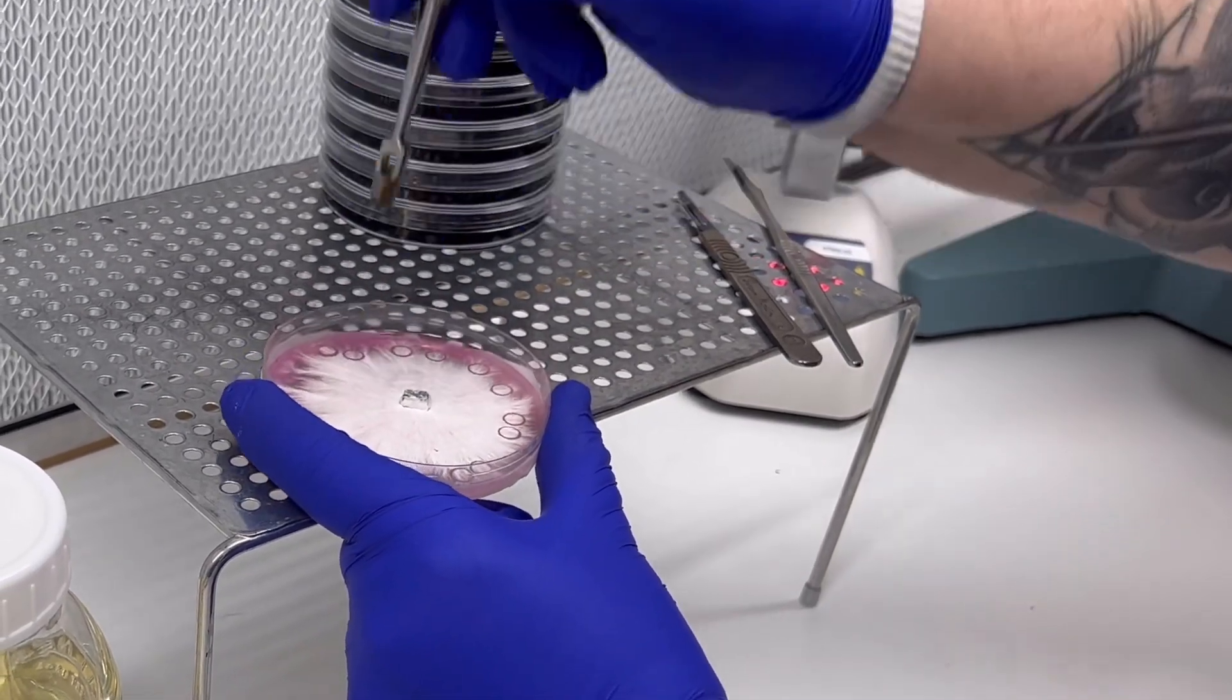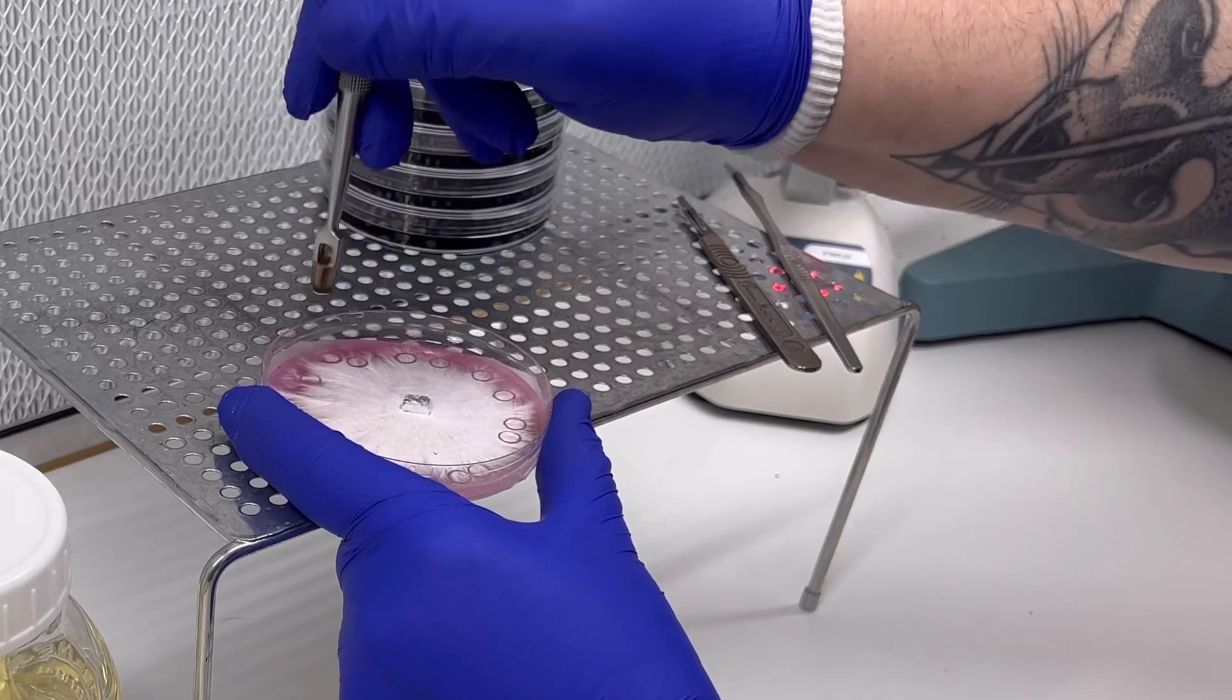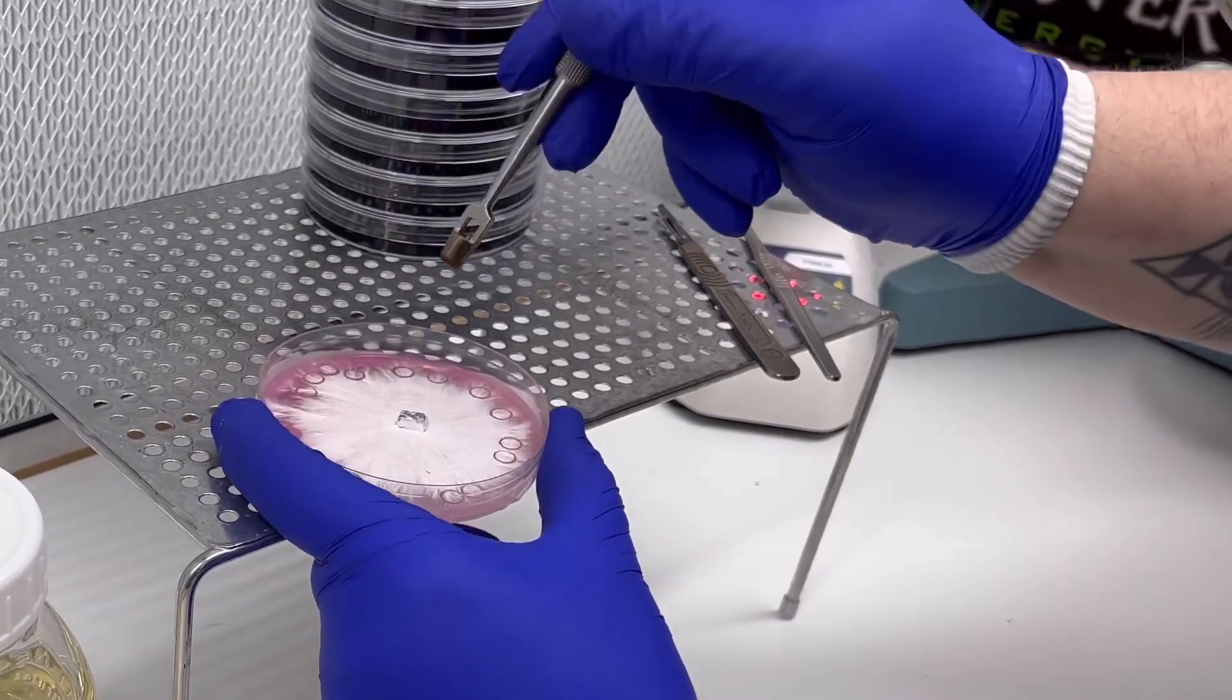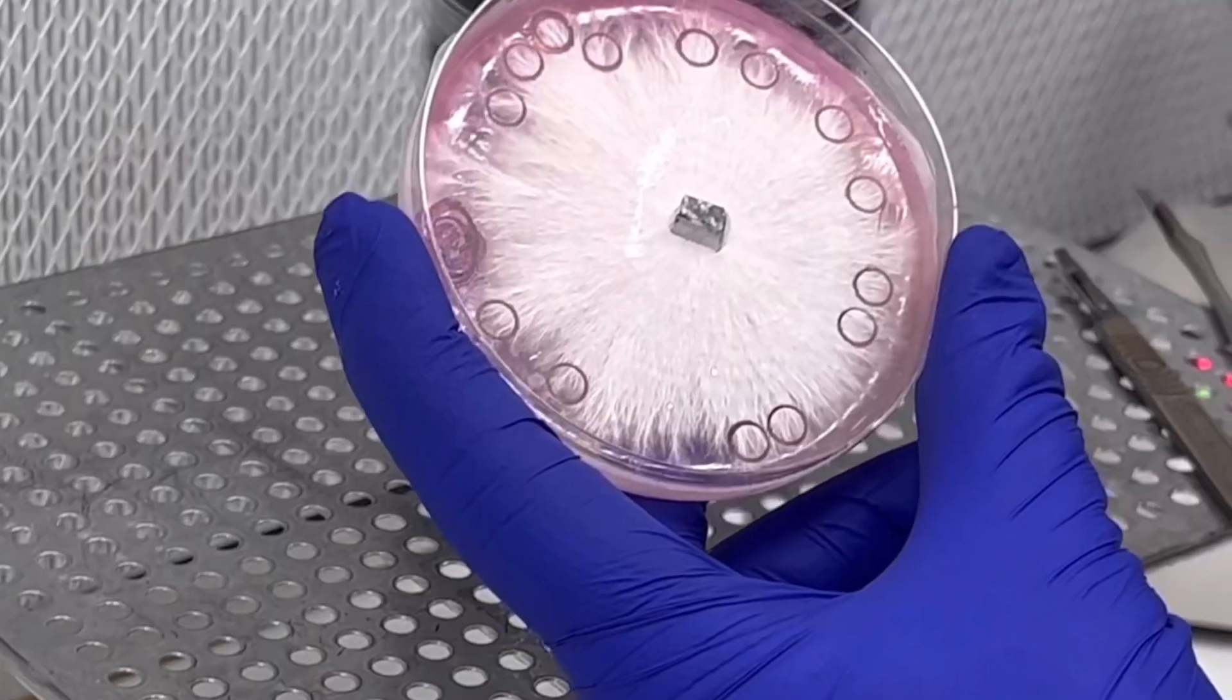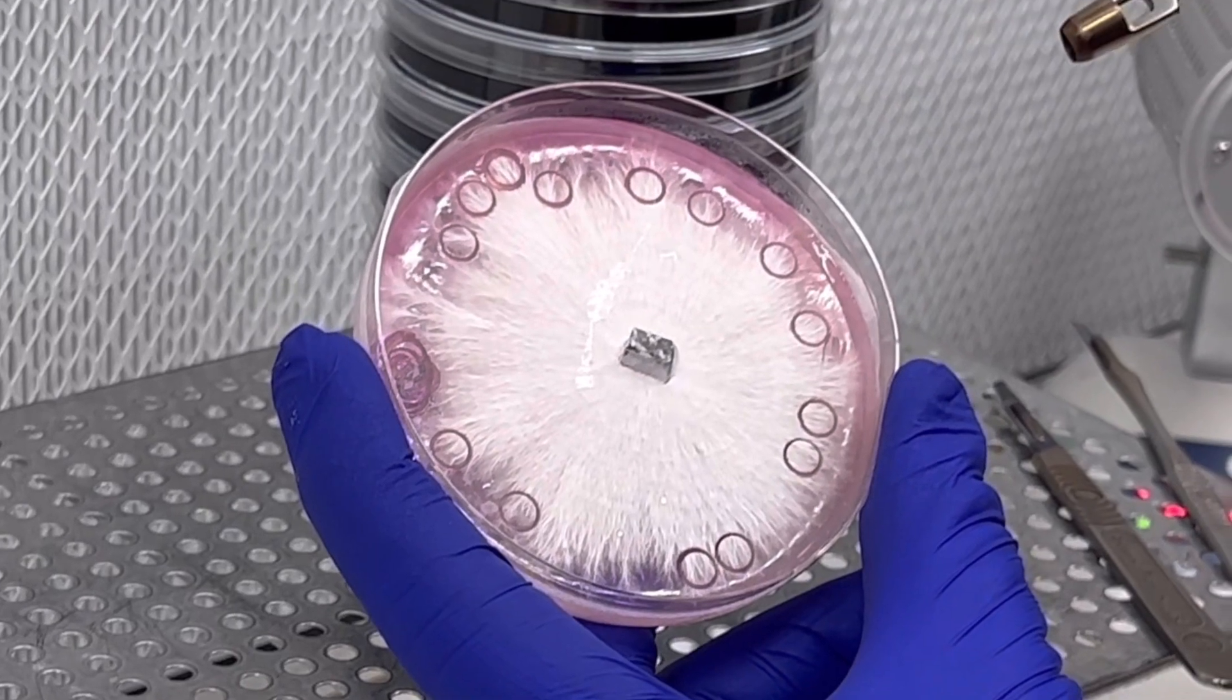What that does is it leaves these tiny little circles. The actual pieces of agar don't come out inside the punch, they're actually just left on the plate like that. So now you've got some decent pieces of mycelium that are easy to transfer from your plate.